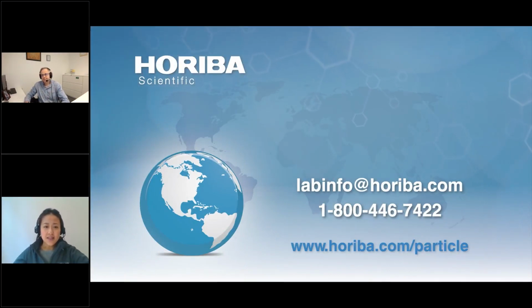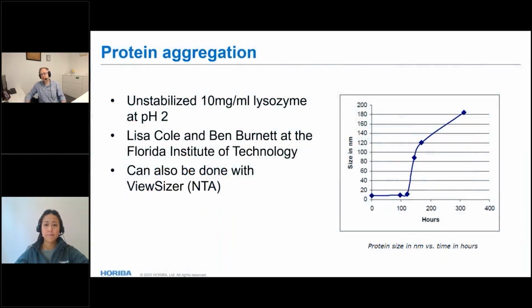Can DLS be used to measure a degree of deflocculation of a suspension by increasing the deflocculation and measuring a changing hydrodynamic size? Yes. Well, yes. So that is kind of the backwards version of the protein aggregation. Now we're going to start with a big flocculate, and you're going to watch the size go down with change in chemistry, and that would work quite readily.